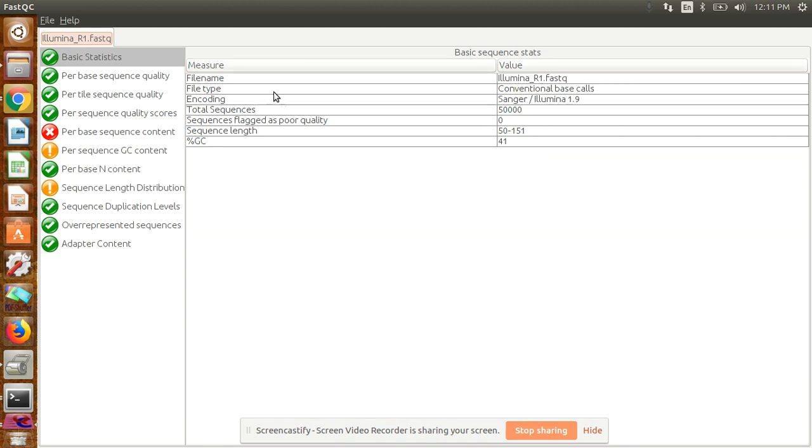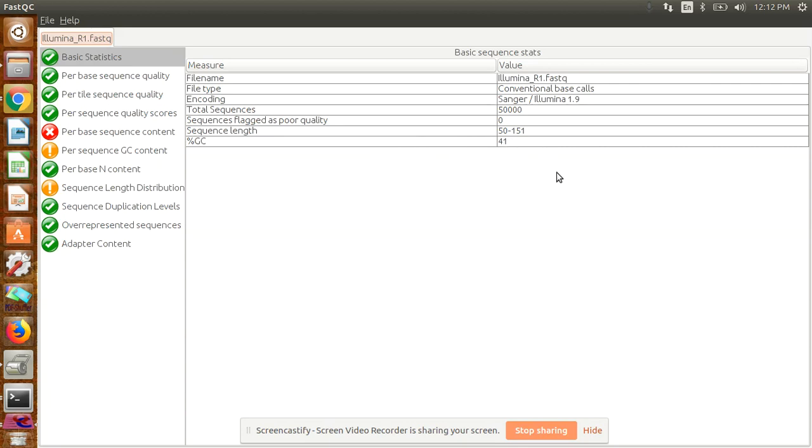Depending on your data size, it will take time. Here it's showing the basic statistics—generated from Illumina platform with total sequences of 50,000, length 50 to 150, and GC content mean 41%. We know there are different platforms. Here we've done 150, so that's paired-end sequencing 150 base pairs. We can go for 250 also.